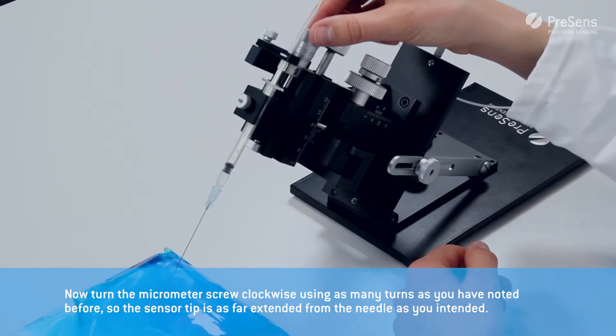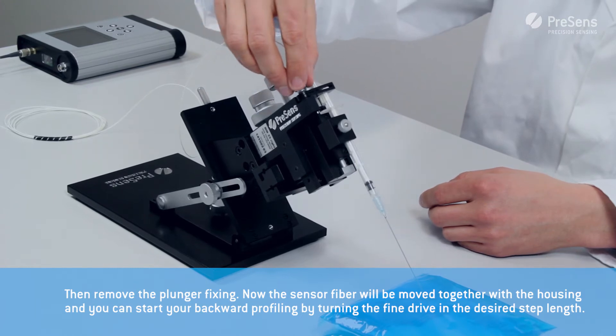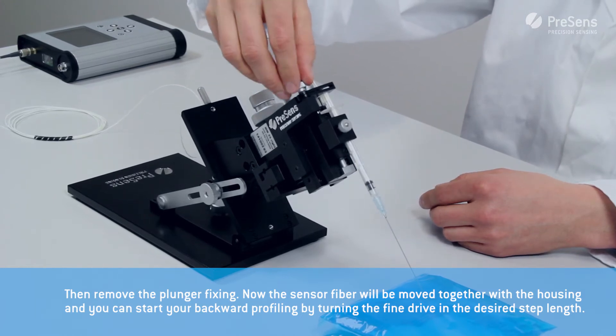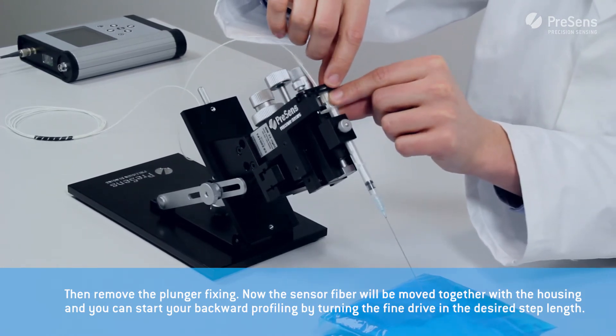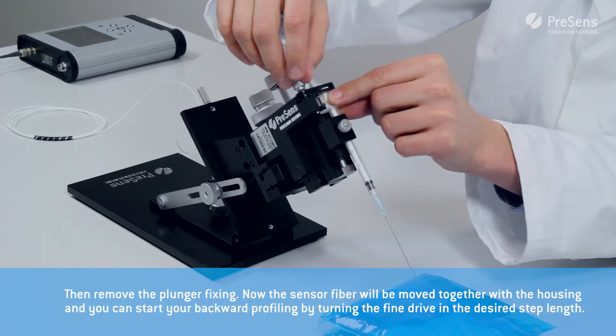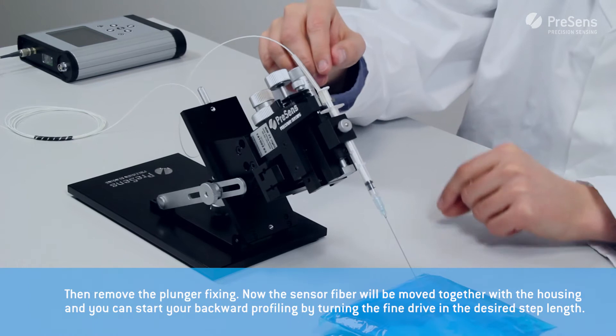Now turn the micrometer screw clockwise using as many turns as you noted before, so the sensor tip is extended as far from the needle as you intended. Then remove the plunger fixing. Now the sensor fiber will be moved together with the housing and you can start profiling using the fine drive in the desired step length.